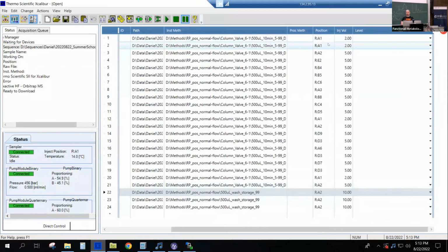To be honest, we use two types of chromatography. We use normal flow and microflow, and I don't want to make QCs for both. So we have it in a range that we can also use it for microflow, and that is better with smaller injection volumes. Now it's pretty concentrated, so at 2 microliters I get a good signal. But for the other samples, this is actually a normal flow method. You can see at 500 microliters per minute, the default injection volume would be 5. I think in an ideal world, we would have the same injection volume. But, yeah, maybe I'm just an amateur.